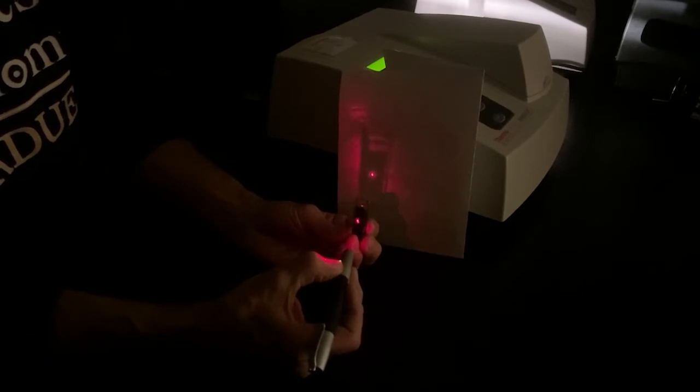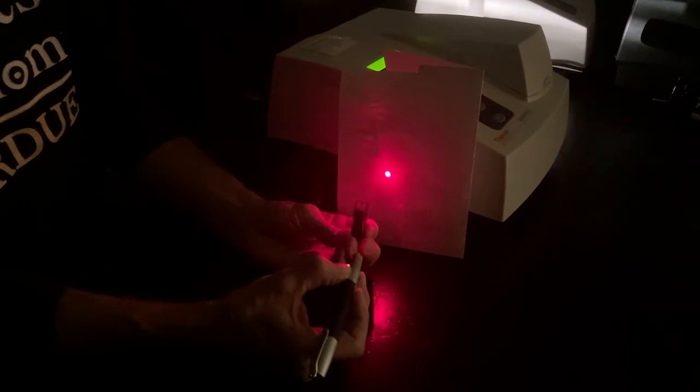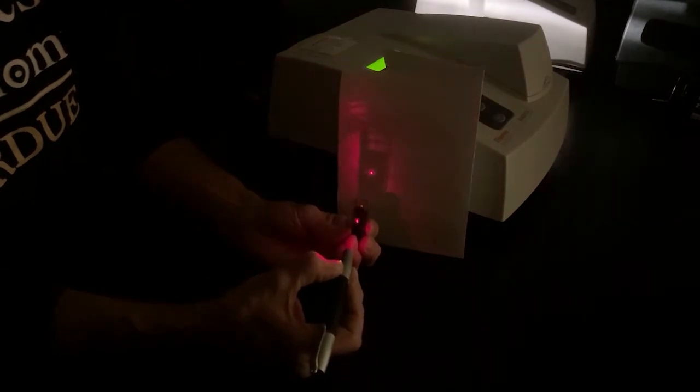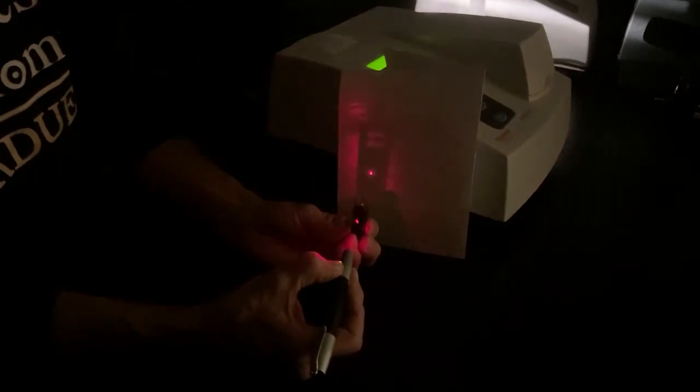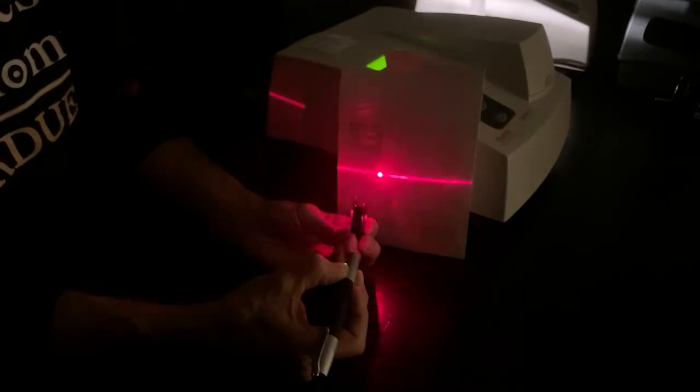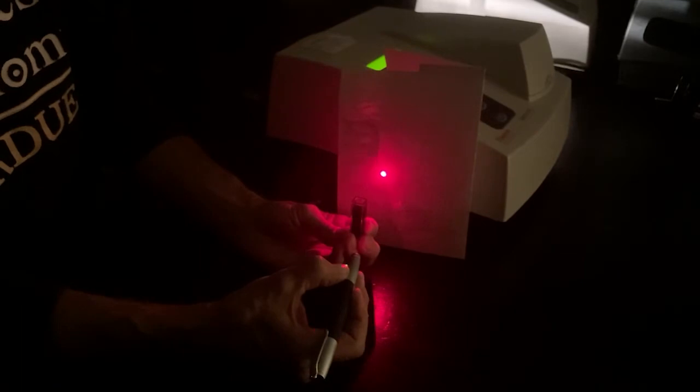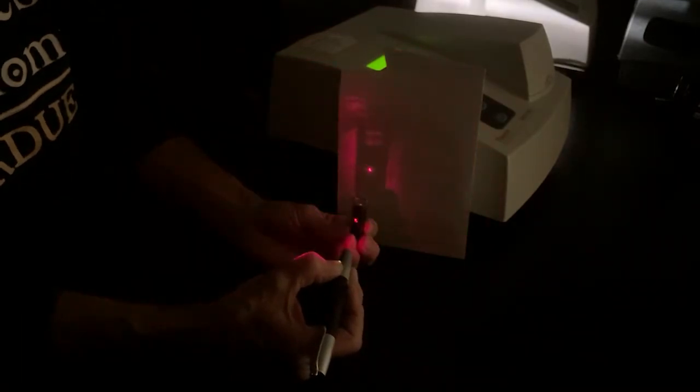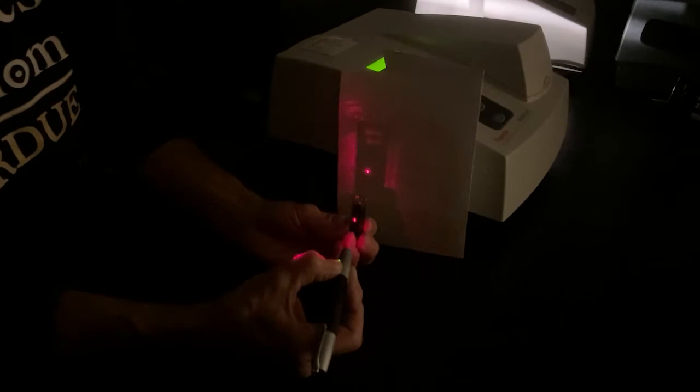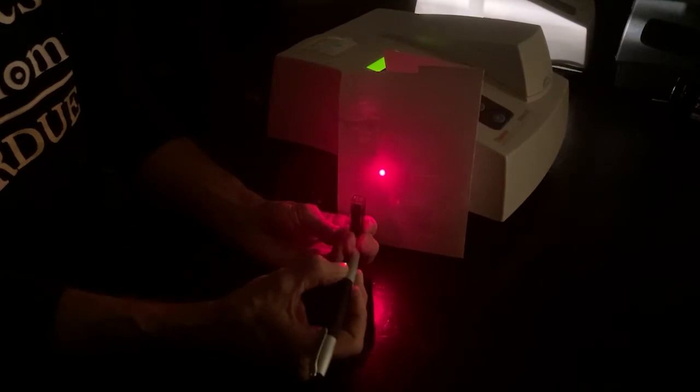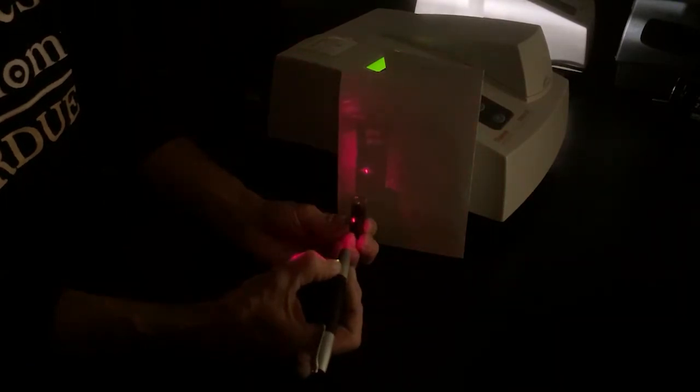Why is it absorbing it? Well, Bill, think about the color wheel. What color is opposite red on the color wheel? Ah, green is. Green. And so, green is the complementary color of red. And in optics, in spectrophotometry, the complementary color is what's absorbed. So, by contrast, what's the complementary color of blue? Yellow. Yellow. So, if we were going to analyze a blue solution, we'd want to use yellow light.